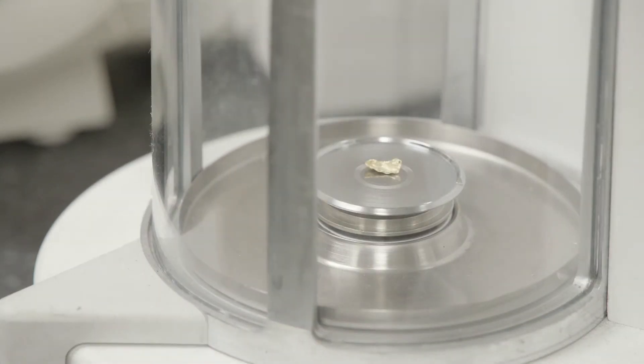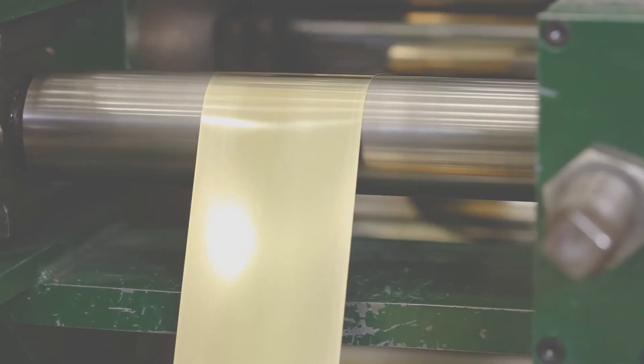We verify that the gold is the correct carat, meeting the legal tolerances for all the FTC guidelines, and also that the other elements in that alloy are within their target guidelines.